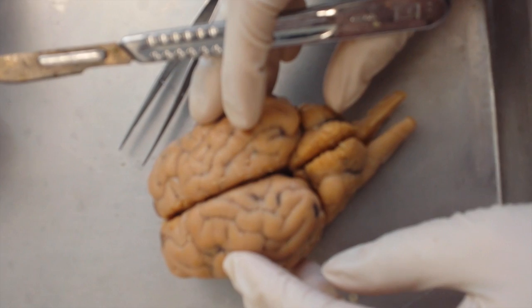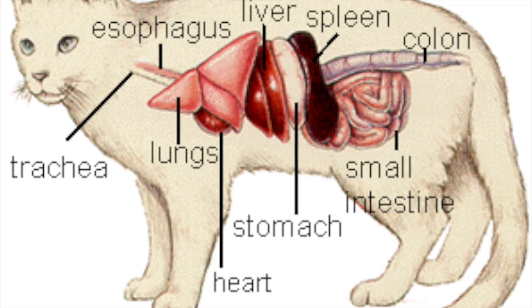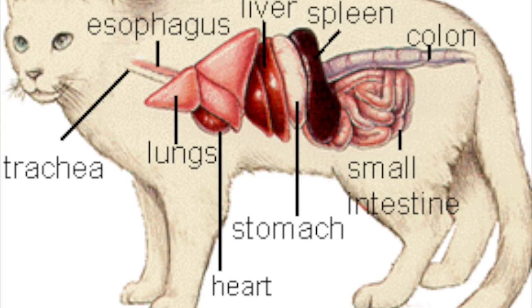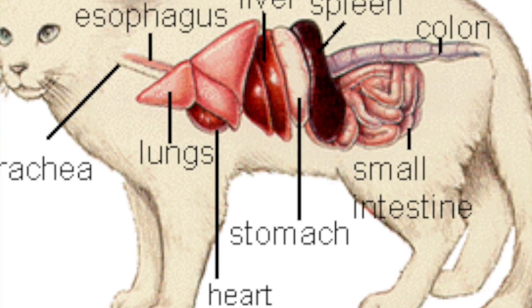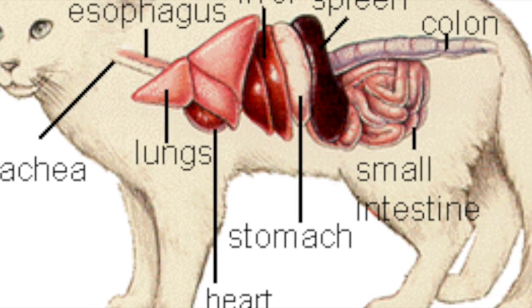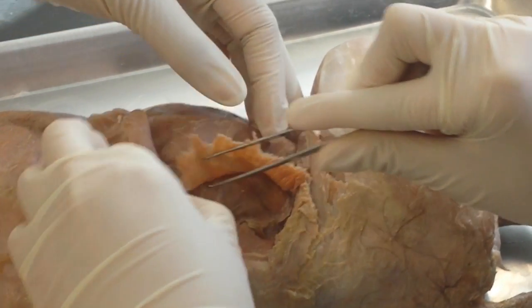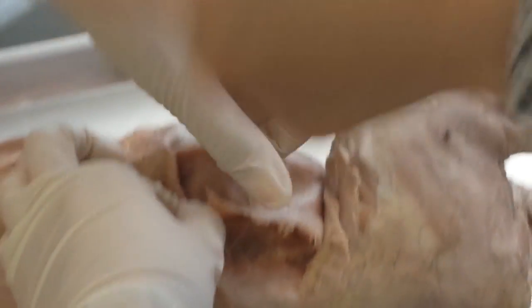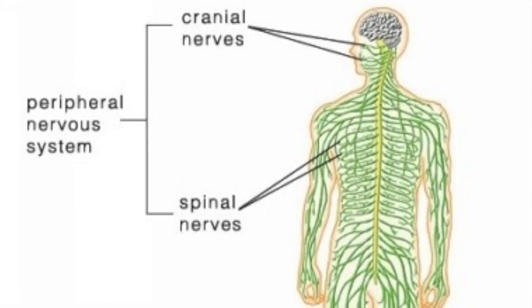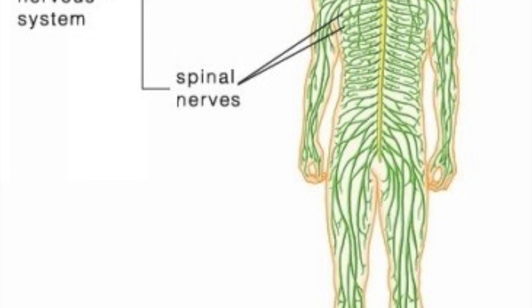The nervous system consists of the brain, spinal cord, sensory organs, and all of the nerves that connect these organs with the rest of the body. Together, these organs are responsible for the control of the body and communication among its parts. The brain and spinal cord form the control center known as the central nervous system, or CNS, where information is evaluated and decisions are made. The sensory nerves and sensory organs of the peripheral nervous system, or PNS, monitor conditions inside and outside of the body and send this information to the central nervous system.